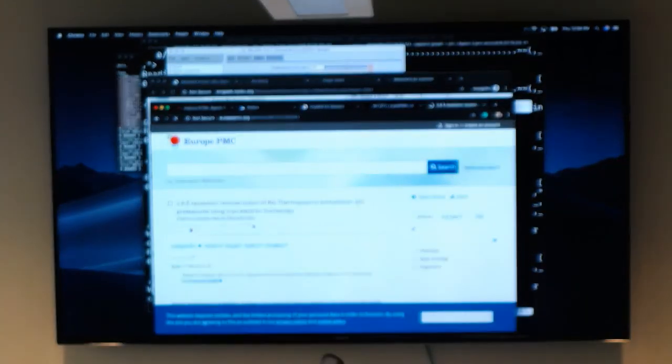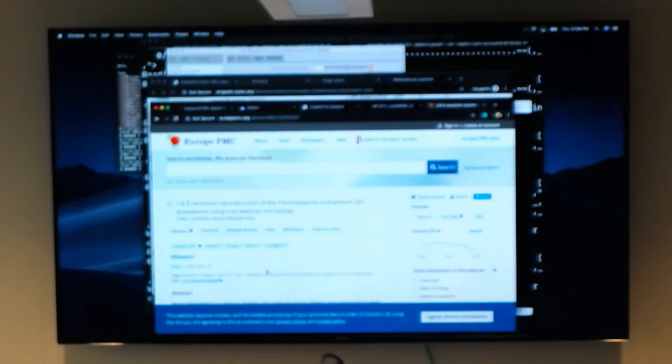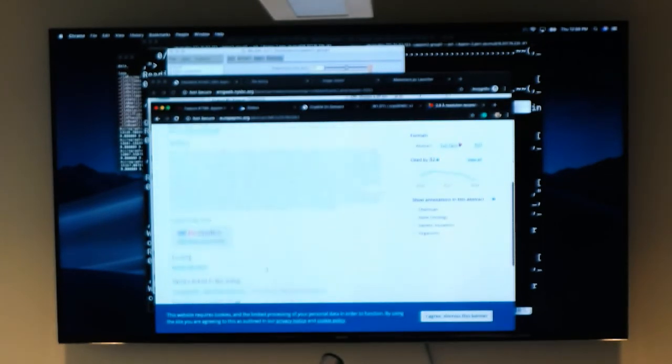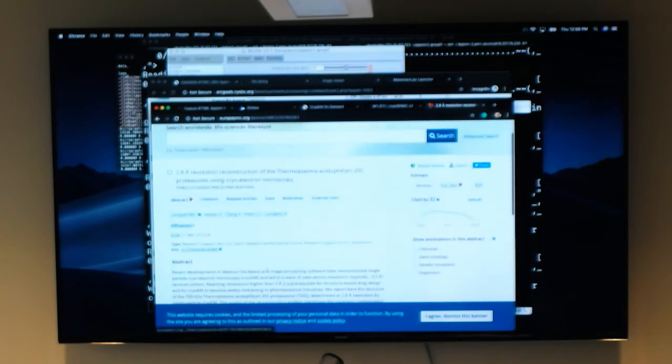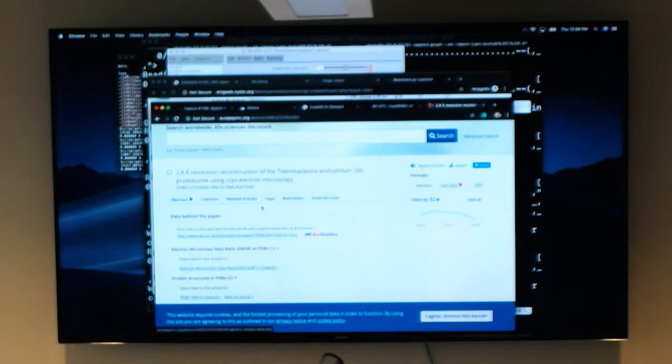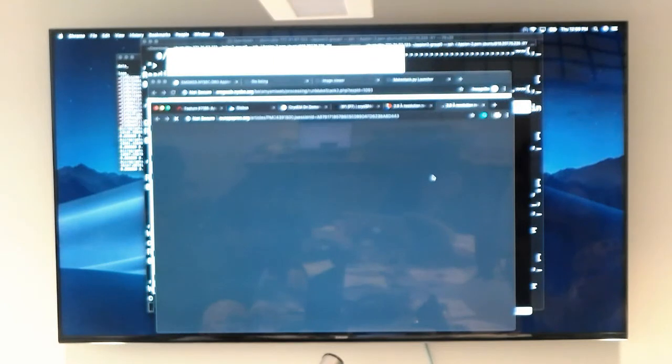Because what's the high tension? What's the acceleration voltage? Well, fortunately, Leginon already gave you a star file with all of that. But let's say you don't have that, then you may have to go in and view it. So in this case, if you go to the EMPIAR data set and you were to use these, it's the aligned sum.